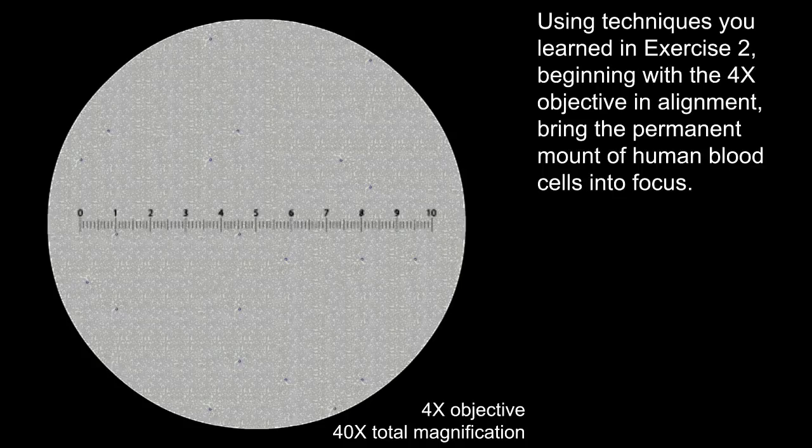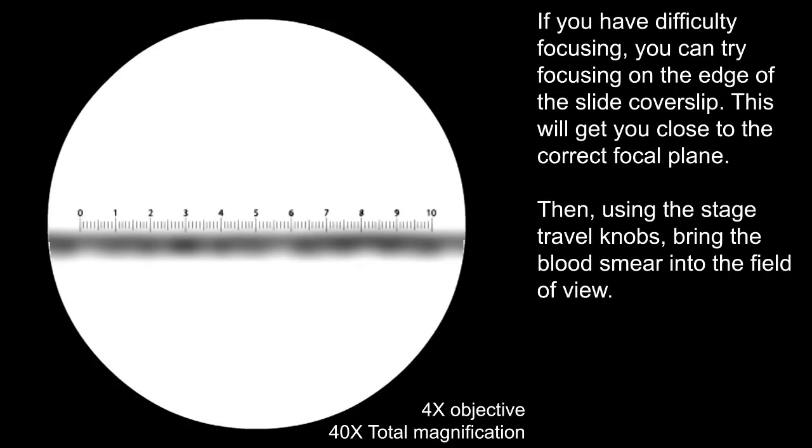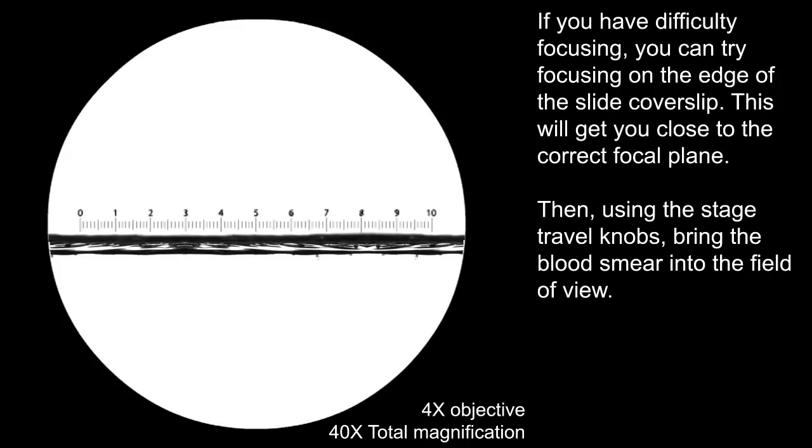Using techniques you learned in exercise 2, beginning with the 4x objective in alignment, bring the permanent mount of human blood cells into focus. If you have difficulty focusing, you can try focusing on the edge of the slide cover slip. This will get you close to the correct focal plane.